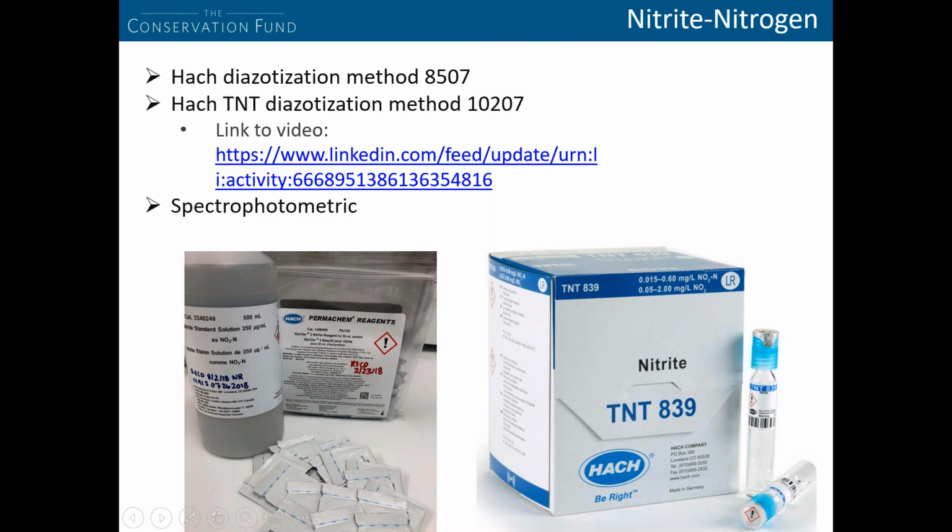Currently, Hach offers 2 options for this method: the powder pillows pictured in the bottom left and the TNT vials pictured in the bottom right. The powder pillows are cheaper, however, they're not quite as controlled. Users can have trouble adding all of the reagent to the sample test vials, or the reagent can be faulty if exposed to moisture. But just like the TAN TNT vials, the nitrite TNT vials have the reagent in the cap. And I've linked to a demonstrative video for this method on our LinkedIn page as well.